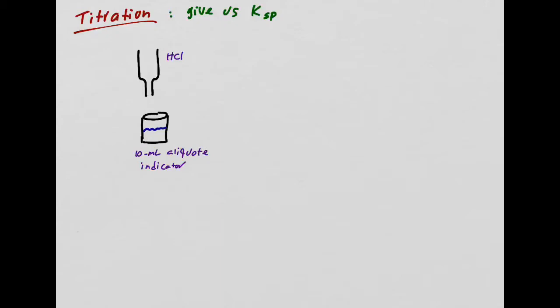I need you to remember, what are we trying to get? What's the goal? I'm actually going to write this down. The goal is to figure out the concentration of borate. The goal is the concentration of borate. That's what we need.